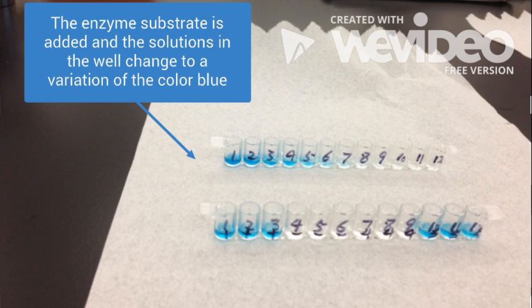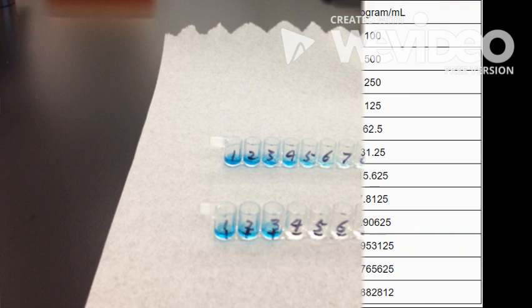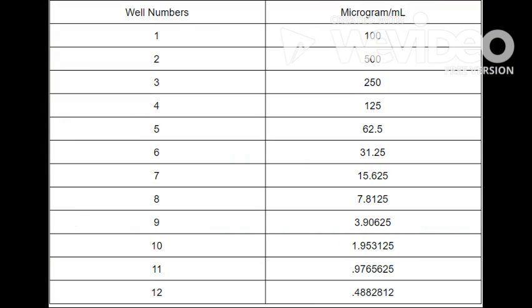When the substrate is added to the enzyme, the solution changes colors, and in this case it changed to blue. The more blue the solution is, the more hormones are present. In the positive control, the solution was blue to show hormones were present, but in the negative control, there was an absence of colors. The graph demonstrates the numbered wells and the concentration.